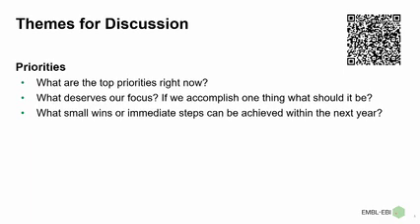We will advocate for these standard formats, MZTab-M, for example. I don't know if anyone else from the audience has some favorite ones they want to shout out. And then we will work with the software developers. So we'll work with Robin from MZMind to get this implemented so it's easy for you to export. And then once you export it, we're working with MetaboLights, who will hopefully have a little converter that you can use to convert into MetaboLights and metadata, everything.